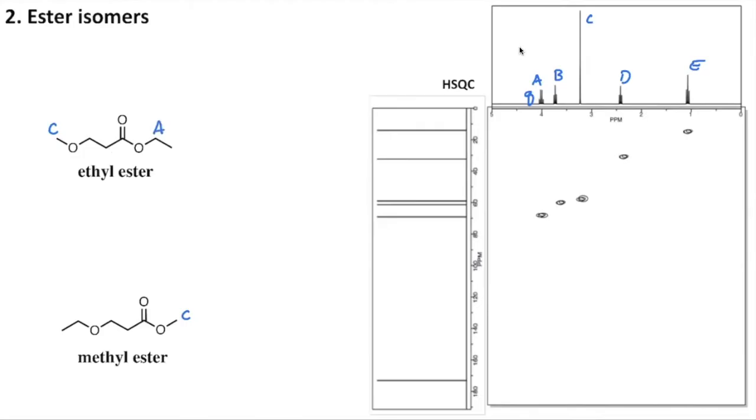Similarly, on the lower molecule, I'm trying to go through and label both of these at the same time because they have all the same pieces, they're just connected differently. The bottom molecule has to be, again, that carbon and those 2 hydrogens, because it's split by the 3 neighbors that are adjacent. So same pieces, different connectivity. All right, and then thinking about B, B is also pretty far downfield and it is a triplet. So that tells us that it has to have 3 minus 1 is 2, 2 neighbors.